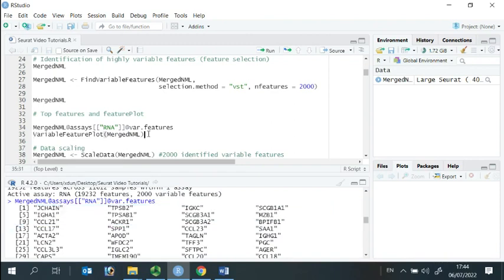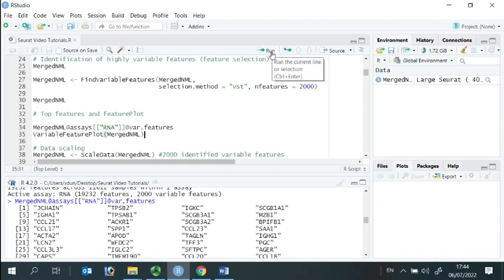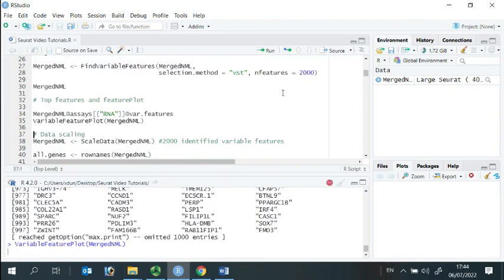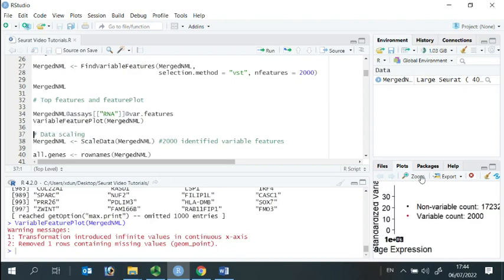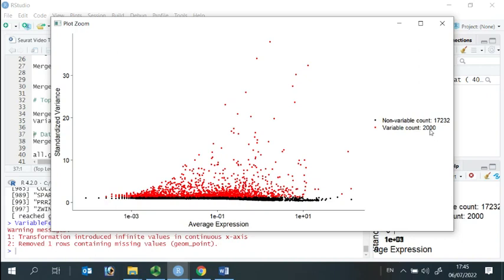We can also use the function variable feature plot to plot the 2,000 variable features. Let's zoom in and have a look at the plot. The red color are variable features, and the black color are non-variable features.